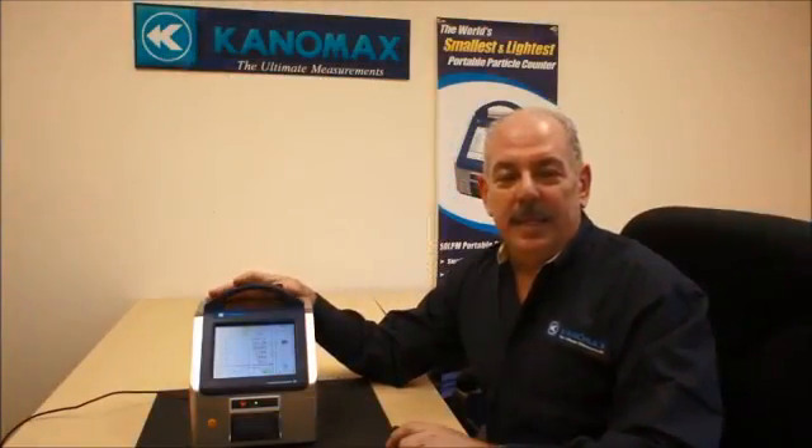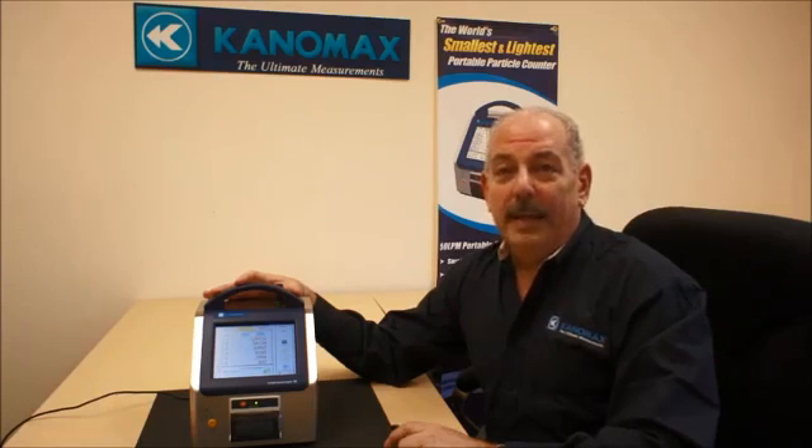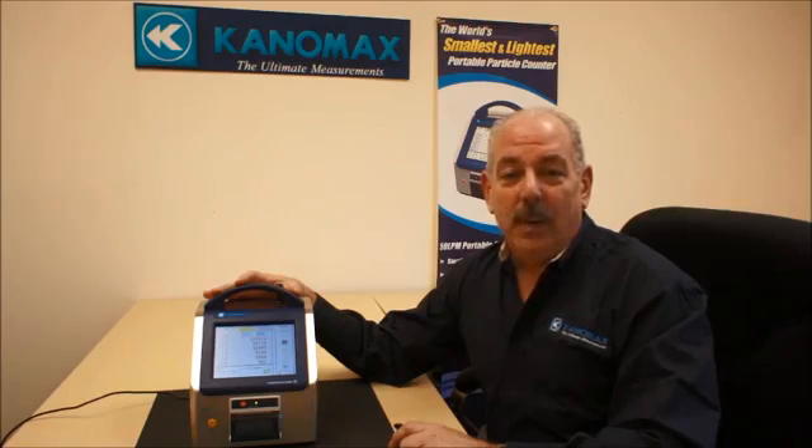Again, the unit is the smallest and lightest in the industry — 28.3 liters per minute and 50 liters per minute. It is 21 CFR compliant with a two-year warranty. Please give us a call if you have any questions. We'd be glad to service your account.